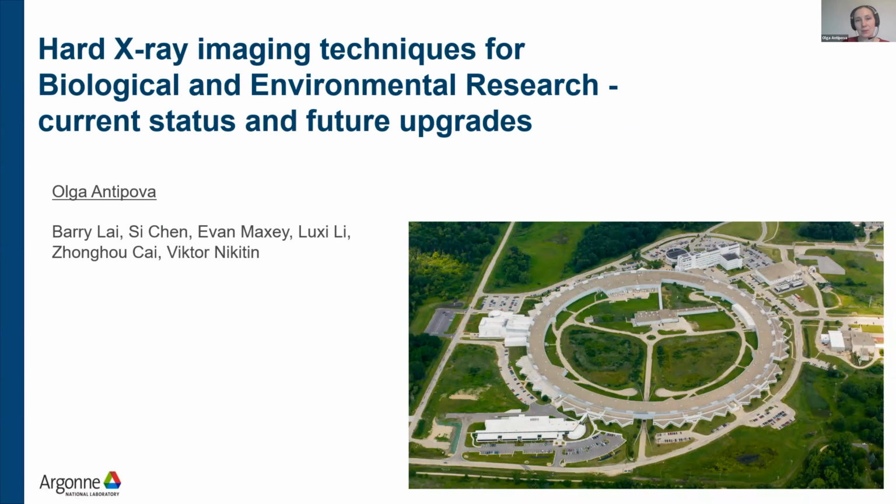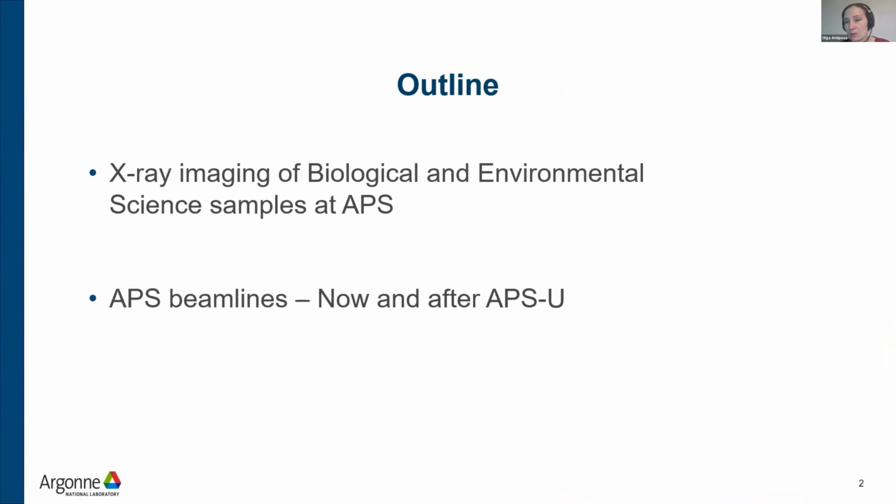Okay, so welcome everybody, and we're gonna start with our workshop where we're gonna discuss hard X-ray imaging techniques for biological and environmental research, what we could do before and what we will be able to do after the upgrade. In my introduction, I would go through what kind of work we were able to do for biological and environmental sciences at APS and what we can expect going forward in terms of instrumentation.